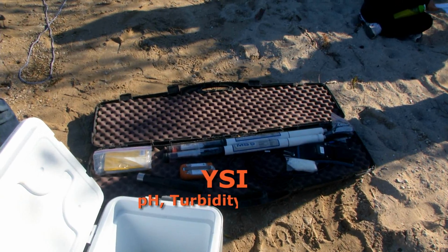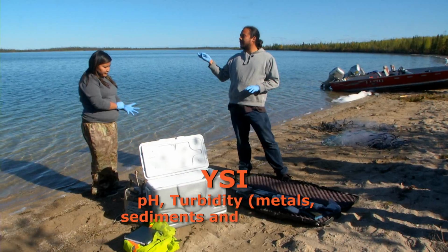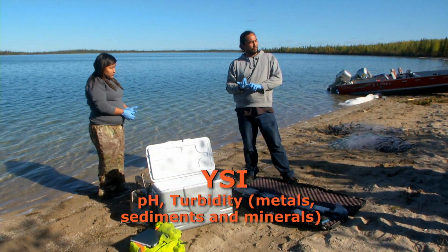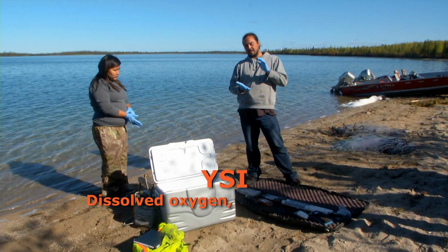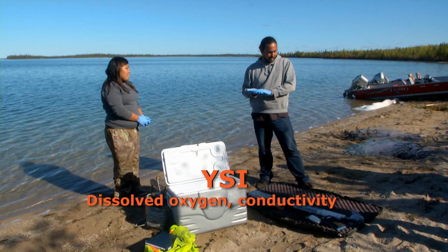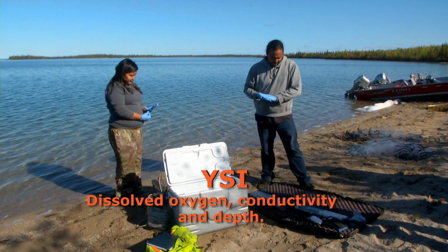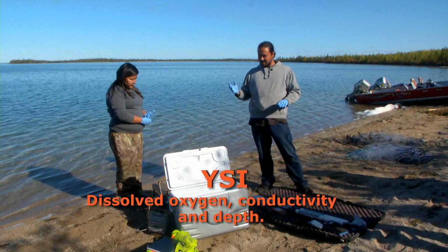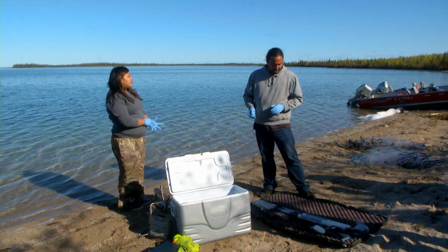Turbidity is the amount of dissolved metals or the sediment and minerals that are floating freely in the water. We'll be testing for dissolved oxygen, specific conductivity, how much electricity can flow through the water. What am I forgetting, Roberta? The depth. And the depth. So when we're doing all of this, I'll be working with the youth, but I'll have them record all the information.